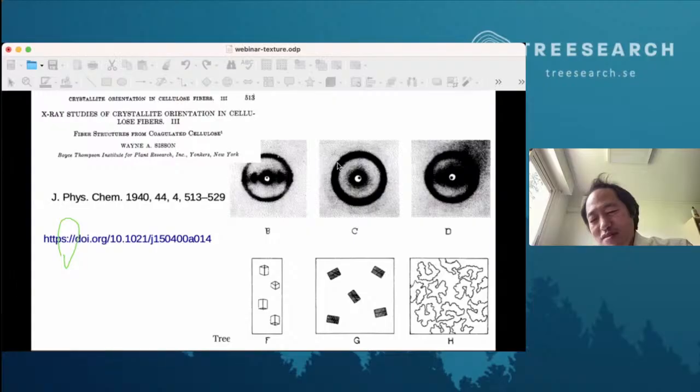And here, if you look with the beam perpendicular to the film, now you don't see this peak at all, because you don't have any of the crystallites in the condition where you're fulfilling the Bragg condition. He can also rotate the film during the exposure, and then he gets this kind of pattern, which is the same as just using rayon fibers. Because it's a question of the size of the beam and the size of the fibers. If you have a much smaller beam than the fibers, then you would see this in the skin. But if you just do the X-ray experiment in a lab, you don't see this internal structure of the fiber, and it is averaged out over the whole fiber.